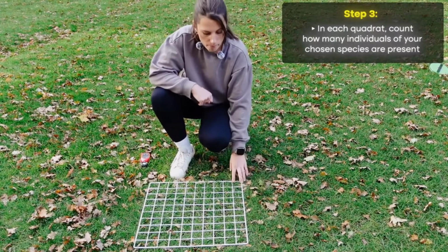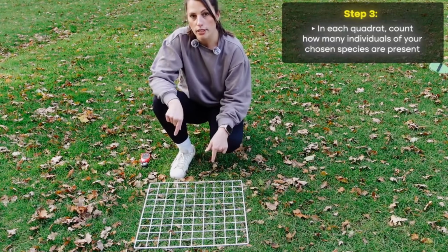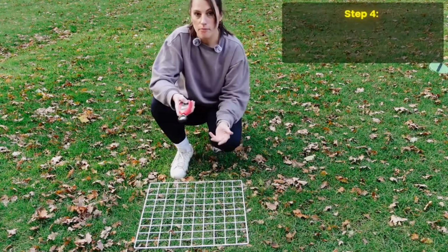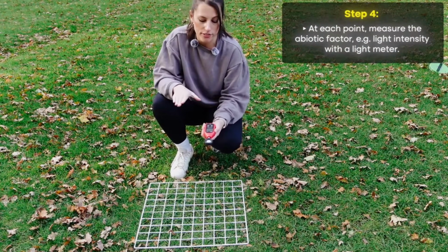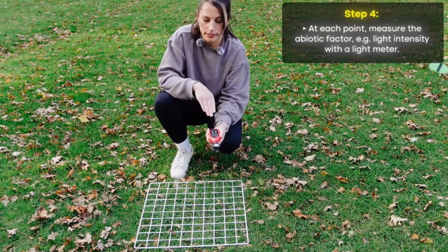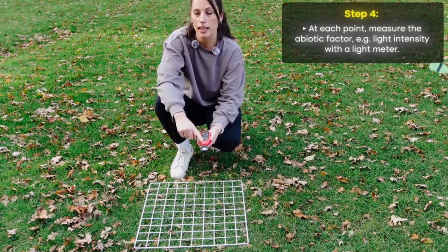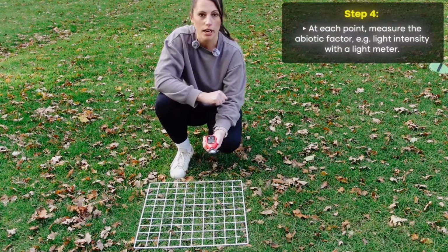So that would be about 12%. So I've now worked out that for one quadrat, I've got 12% in terms of clover coverage. If you were then going to measure any other variables, so I have a light meter here, I could record that at every site as well to see later on, is there any correlation between the light intensity and the percentage cover? So for this one, I need to hold it out, making sure the sensor is exposed to the light, hold it still, and then I can record down my light intensity.